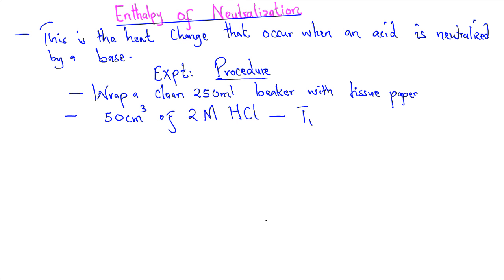Using a clean, dry measuring cylinder, measure accurately 50 cubic centimeters of 2 molar sodium hydroxide. Note it as T2.